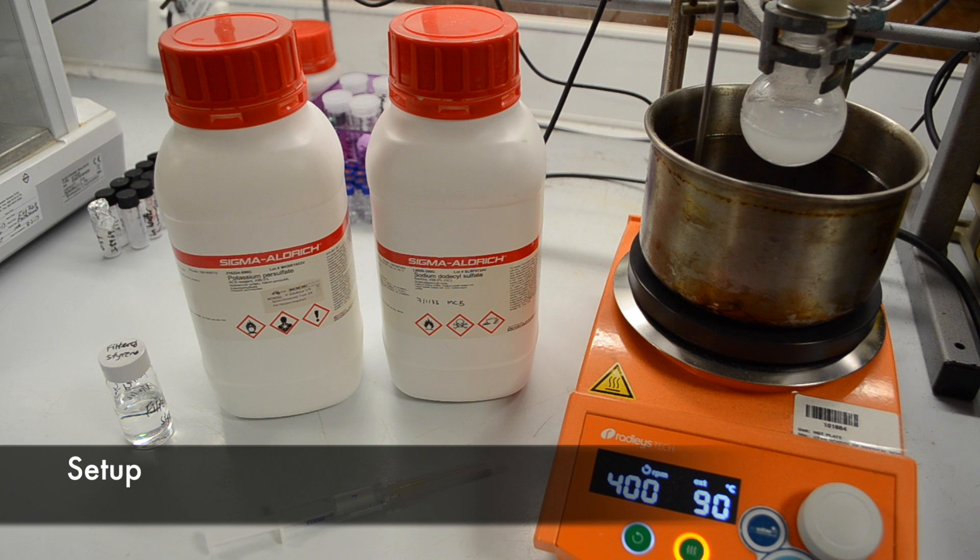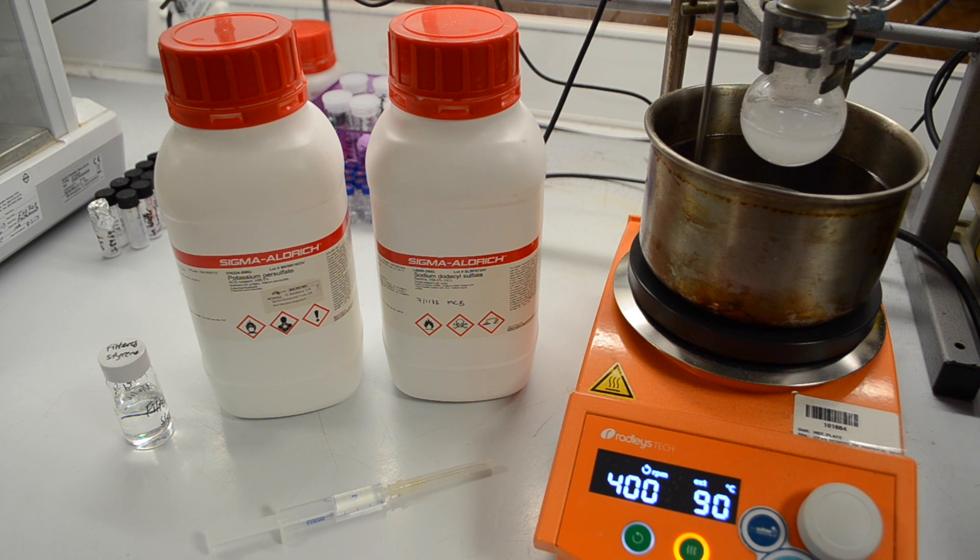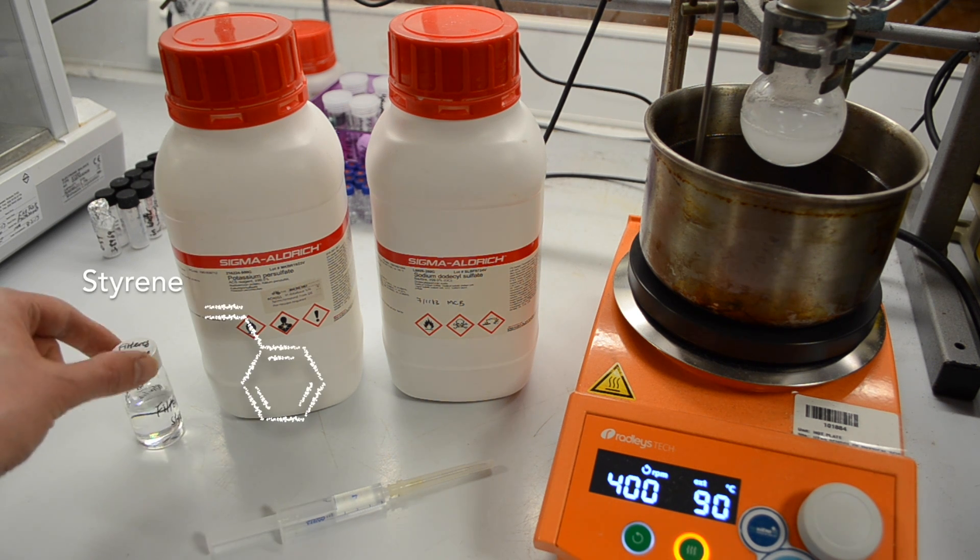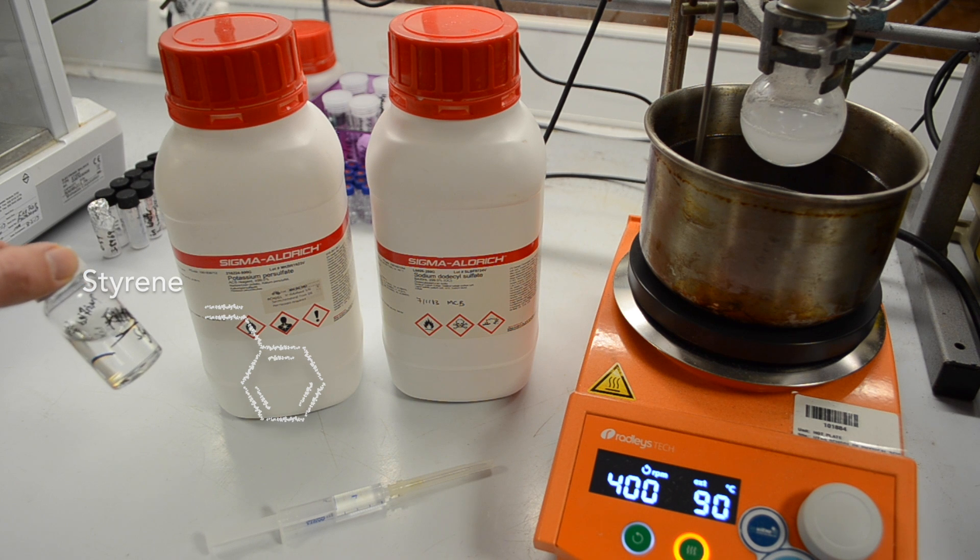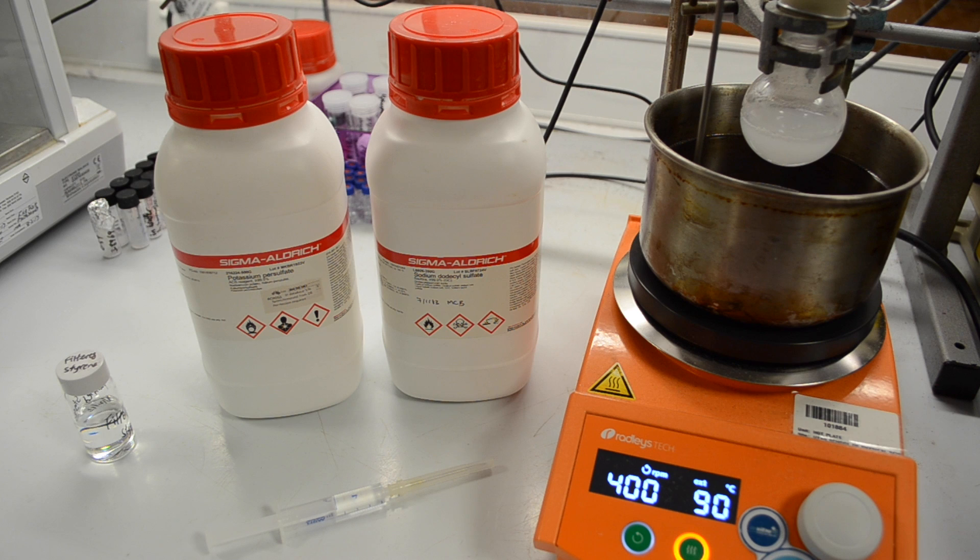So we're about to begin our emulsion polymerization reaction now, and I'd like to point out a few of our reactants that we're going to use. Firstly, we're going to use an oil bath that's already set to 90 degrees. We're going to begin our reaction at an elevated temperature. We've got our monomer, which in this case is styrene. That's the thing that we're going to use to make our polymer.